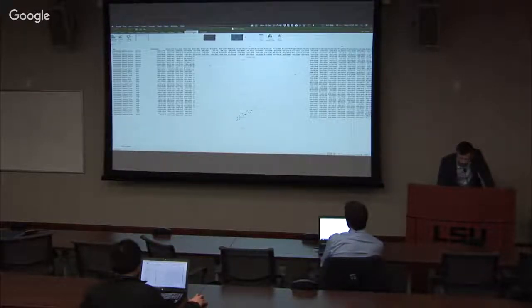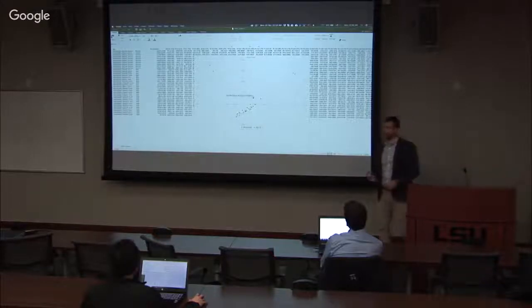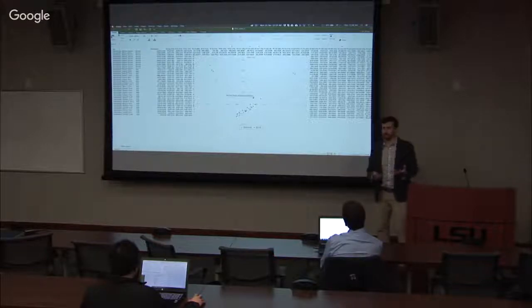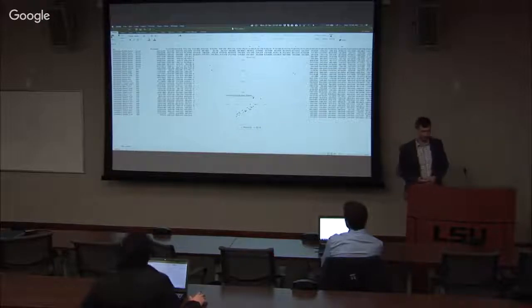Let me just add the legend here. Okay, so the normal ones are actually right here, and this is some kind of a split between DCIS. So it doesn't show me the variance in my data. The biggest variance isn't between normal and cancer. It's actually within the cancer data set. And that shouldn't happen. Just biologically speaking, that's not what we're expecting to see.